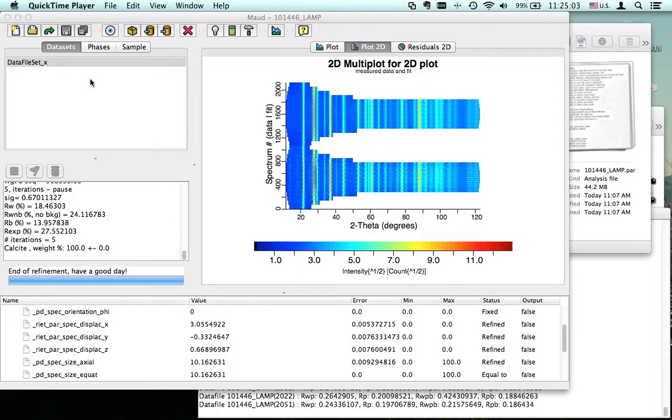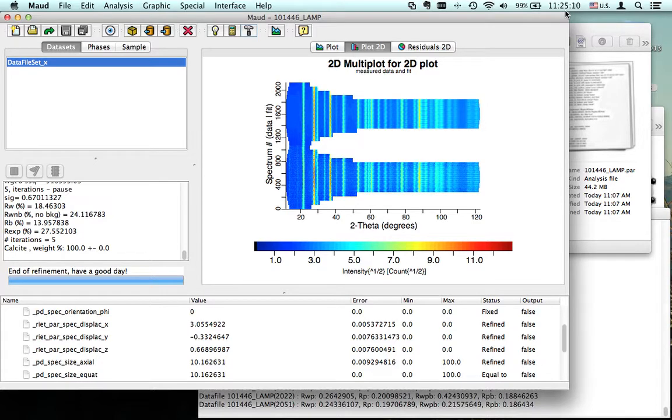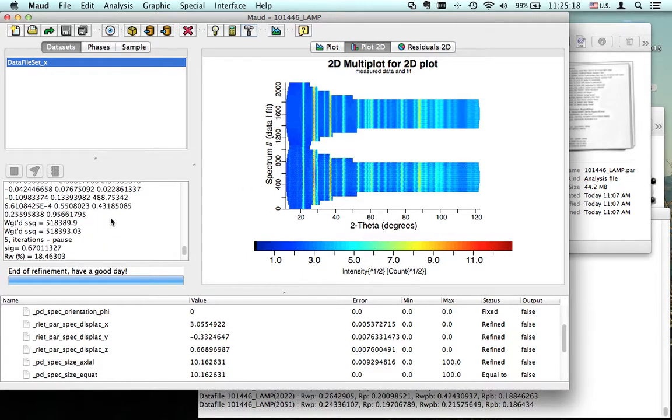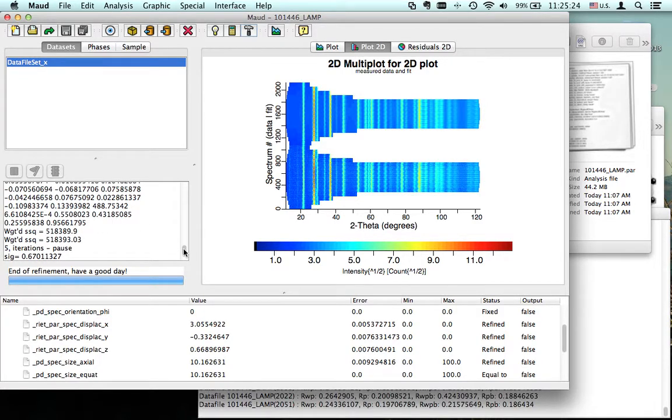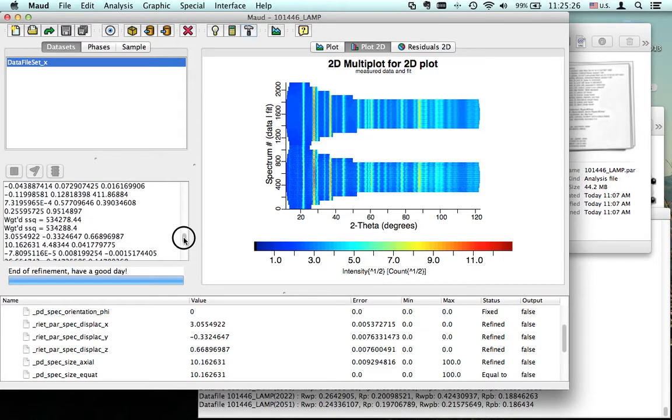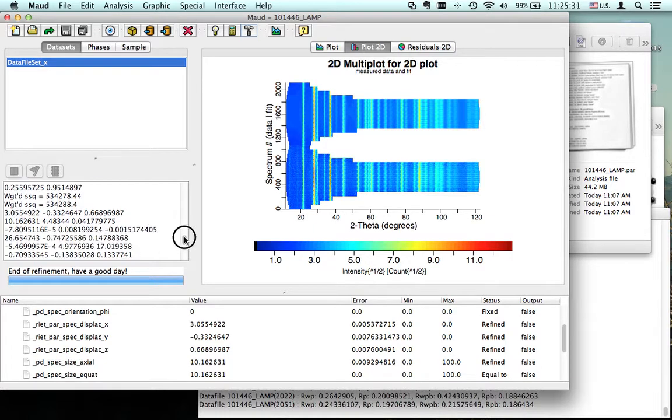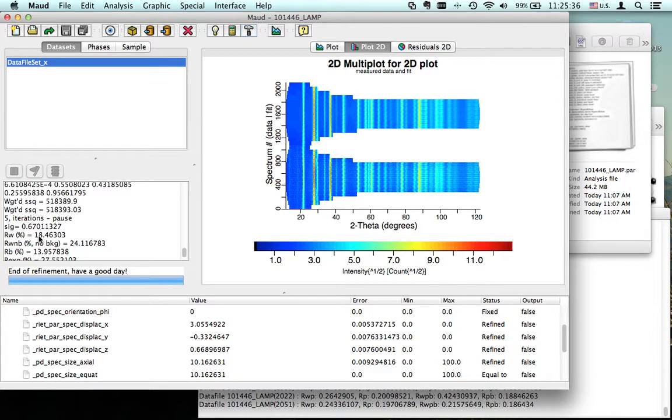Okay, so here we are, it's finished. If you look at the time over here, it took 13 minutes nearly to complete the five iterations. So it was going down to five hundred thousand, and the last iteration was still going down. If you run it a little bit more, it will go down a little bit. The RW is 18, so this is actually a complex analysis.